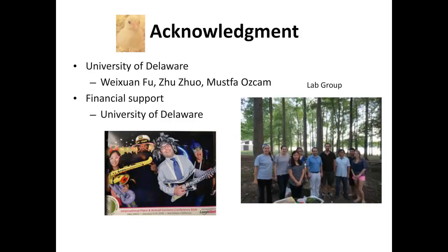Number 26 is, what was the significance of the complementary poly-T tail? Because we talked about how we use a primer that has poly-T to attach to poly-A. So this also can attach to a region of the genome that has a poly-A stretch and produce false positives.